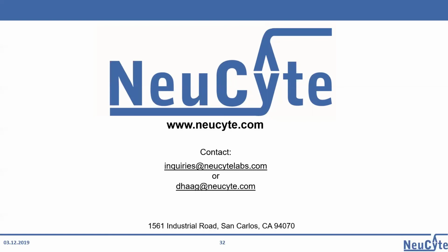Yeah, so we have run a pilot project on calcium imaging, and again, this brings out the advantage of the modular production of the different cell types, as you can transduce the reporters in just the neurons or just the glutamatergic neurons, which gets rid of the background noise of the calcium waves of the astrocytes otherwise. We have run in a high throughput setting a couple of dosing experiments similar to the pharmacoprofiling on the MEAs. We are currently evaluating and analyzing and matching that up to the data that we have on the MEAs. I also think that this data will come online fairly soon, probably this year.